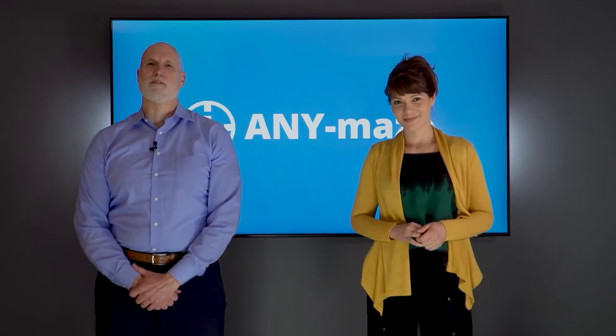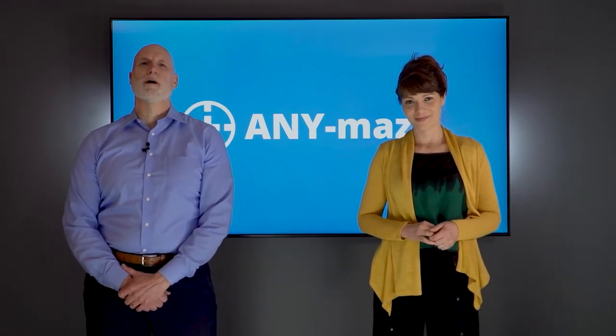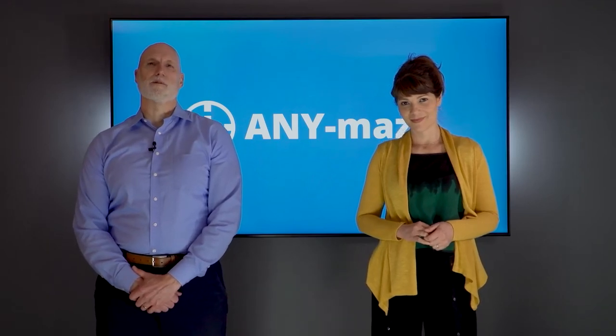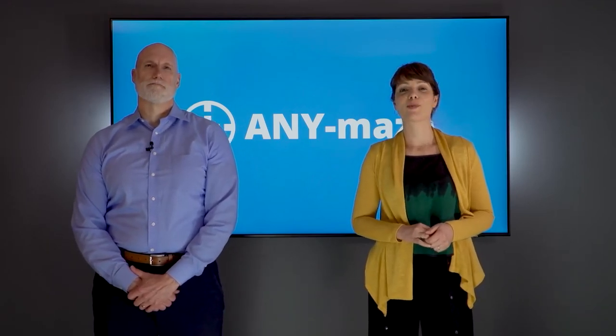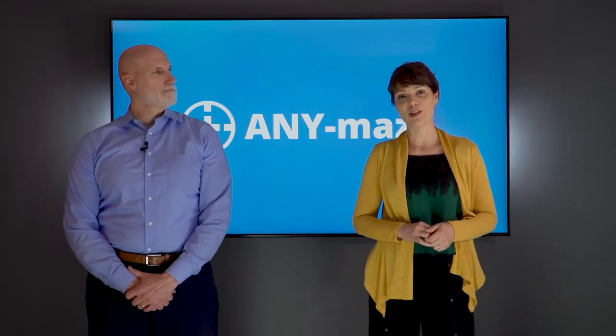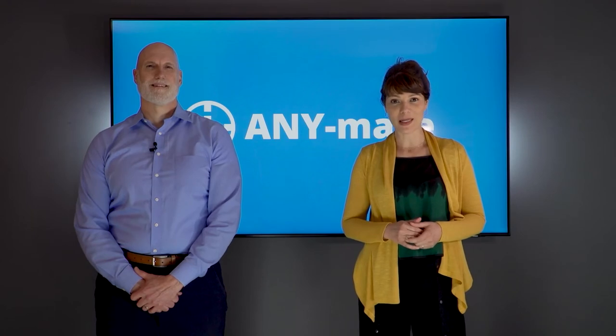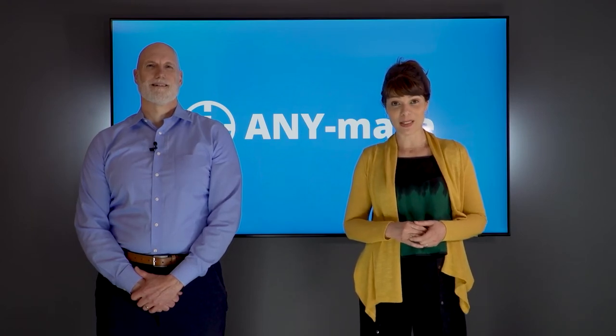Thank you. Today we're here to introduce you to the ANY-maze Operant Interface, which has been designed to make it simple and straightforward to automate operant experiments using the ANY-maze software. You've probably already heard of ANY-maze as a video tracking system, which is widely used to automate tests such as the plus maze, the open field, the water maze. So you're probably wondering why you would want to use ANY-maze to perform operant experiments.